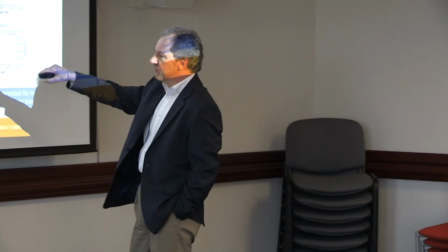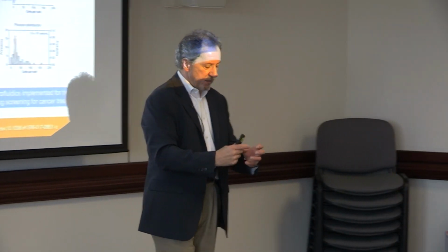This one where they're using droplet microfluidics and a silicone type micro device to essentially exploit how E. coli produce certain pharmaceuticals. And so now in one device, you essentially can figure out how to genetically engineer one strain of E. coli so that they produce in high efficiency the type of pharmaceutical that you're interested in. This is one now that dovetails into precision medicine, where now inside of a droplet, they'll put 100 or 1,000 cancer cells from the tumor of the very patient who provided that sample, and now do drug testing in the device to figure out which cocktail of chemotherapeutic agents actually work.